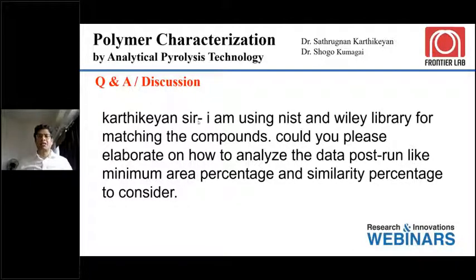Okay, you are using NIST for matching the compounds. If you are using NIST, that will help to analyze most of the additive compounds. But for the polymer, NIST may not be able to tell you what kind of polymer. Some of the pyrolysis may give you a kind of peak, but the matching will be a difficult task. Again, we need to know more details on the data post-processing, like the minimum area percentage. Those are different factors to consider. So please drop an email to me with details, then we can see how we can help.